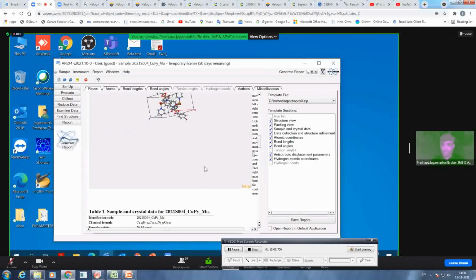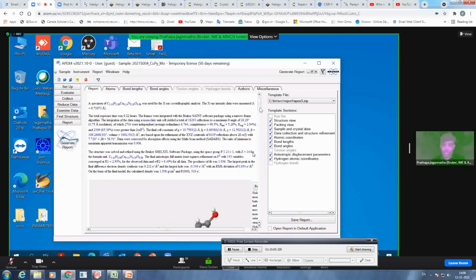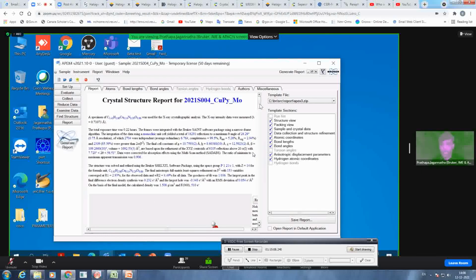Okay, so that's all I wanted to show you in this 1.5 hour workshop. So I am here for the next 4 minutes. I can see some questions, so I can take some questions. Okay, so yeah, Kenji has already replied. So let us know if you still have some questions. Feel free to ask in the next 3 minutes. We are here. And if you are shy and want to ask later, you can write us an email and let us know how you find it.